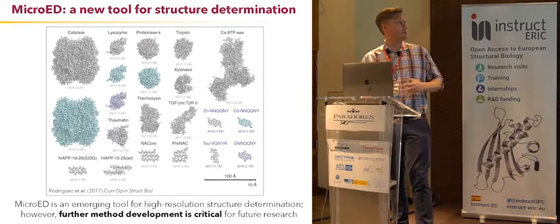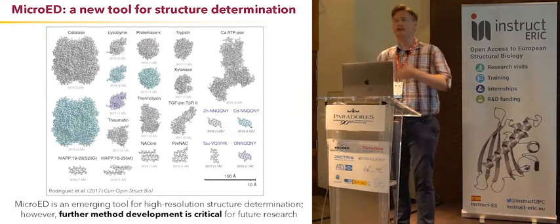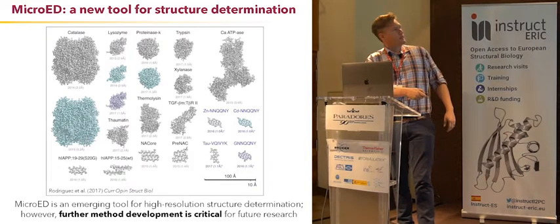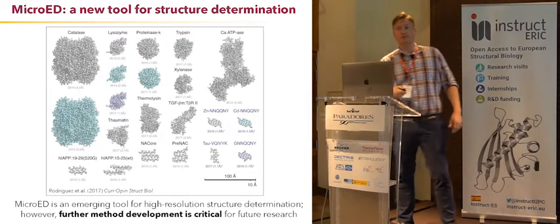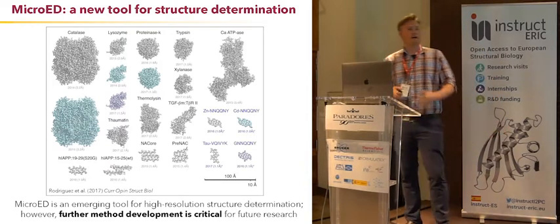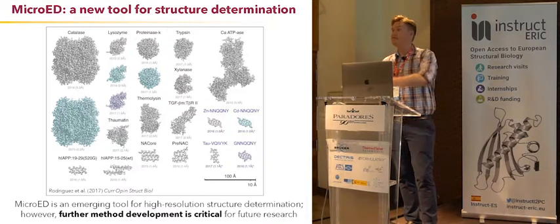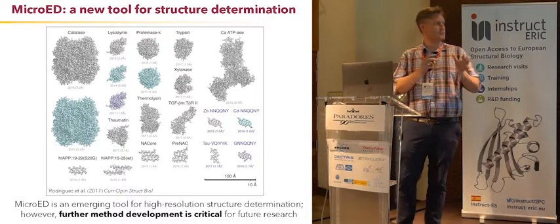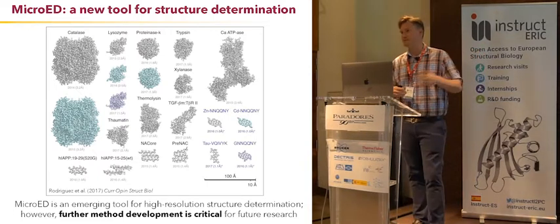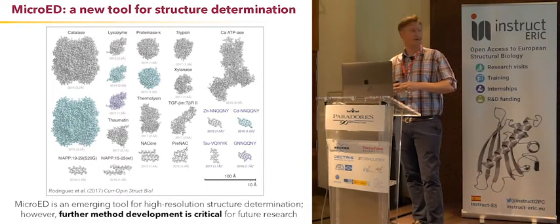Since we have worked on it, both our lab and other labs have solved quite a few structures of different proteins and these different peptides, which was a really great collaboration between our lab and David Eisenberg's lab at UCLA. It served as the first real sample. They brought these amyloidogenic peptide fragments to our lab, and sure enough, they diffracted to about 1 angstrom, and we were able to solve a whole bunch of their structures for them.